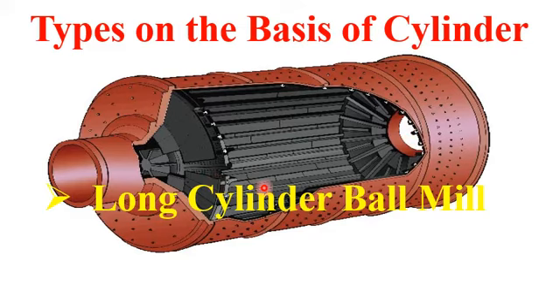So on the basis of the length and diameter of the drum of the ball mill, the types of cylindrical ball mill apparatuses are classified.